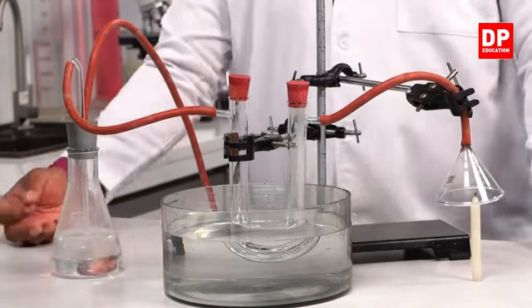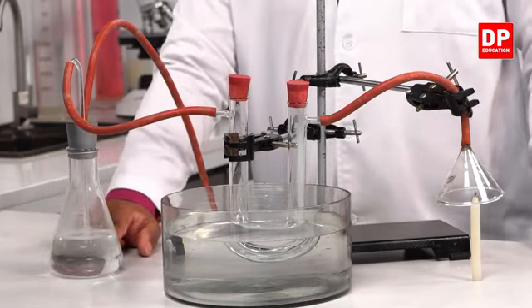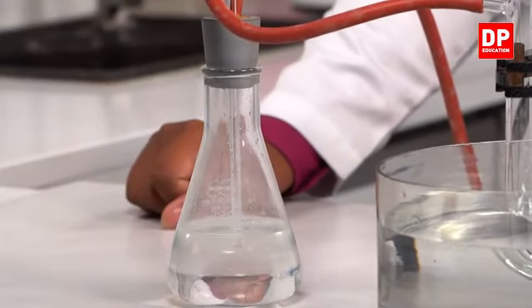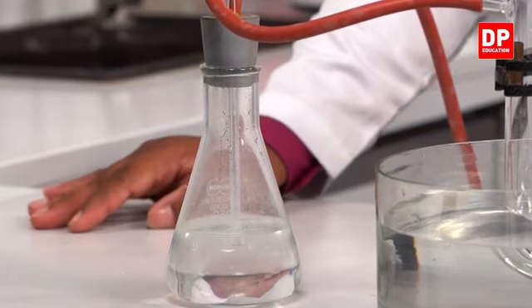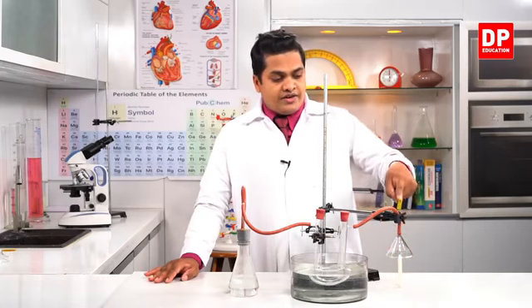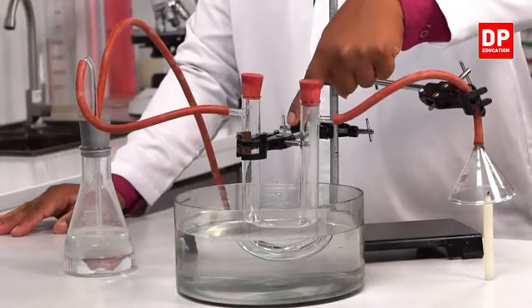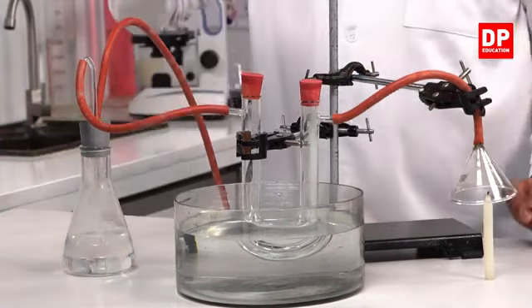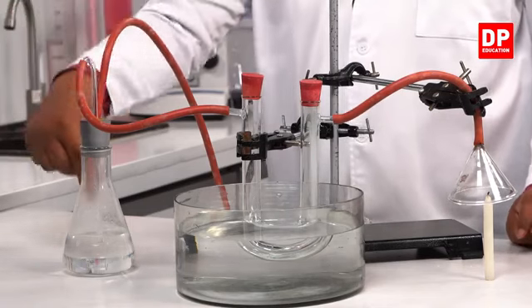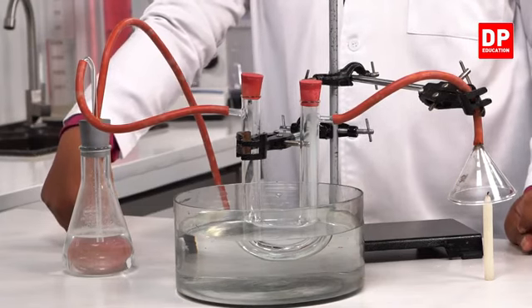This vessel contains lime water solution. You can observe it is colorless, right? The lime water solution does not contain any kind of color. So the smoke coming out from the candle passes through the delivery tube towards the U tube, goes through the anhydrous copper sulfate crystals, comes out the other arm, goes through the delivery tube here and comes down, bubbling through the lime water solution, right? That's how the apparatus works.